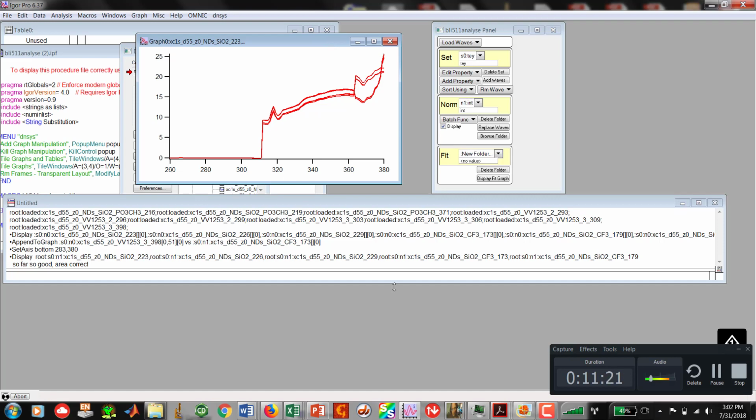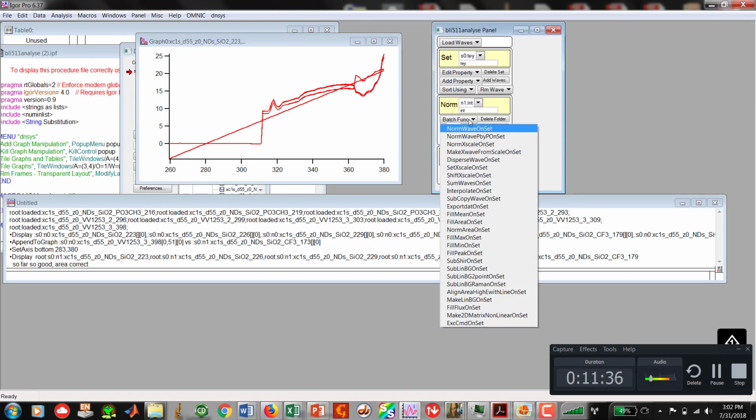Now let's say, for the sake of this video, because I don't want it to be too fast, I'm going to abort. I'm going to hit OK. And it looks like we did some little wonky work on our data set. It didn't finish up. Everything's kind of screwy. Don't worry about it. Let's go back to the batch function. And then from batch function, we're going to do one of the area plots, because we want to be able to say that we have our data set that is normalized to 1 in the high energy regime, which would be at 380.